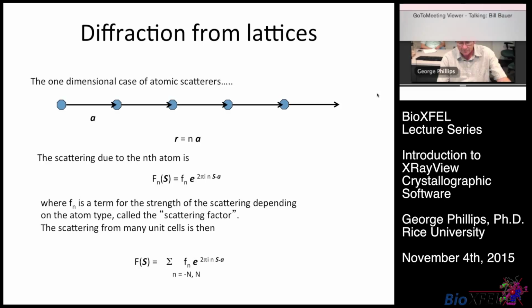Yes. Okay. So I'm going to briefly talk about diffraction from lattices and where the reciprocal lattice comes from, and then we'll look at examples of the reciprocal lattice with the simulator. So I sort of developed this for teaching my structural biology class, starting with the definition of lattice and what diffraction is, and then how the diffraction of a lattice manifests itself.